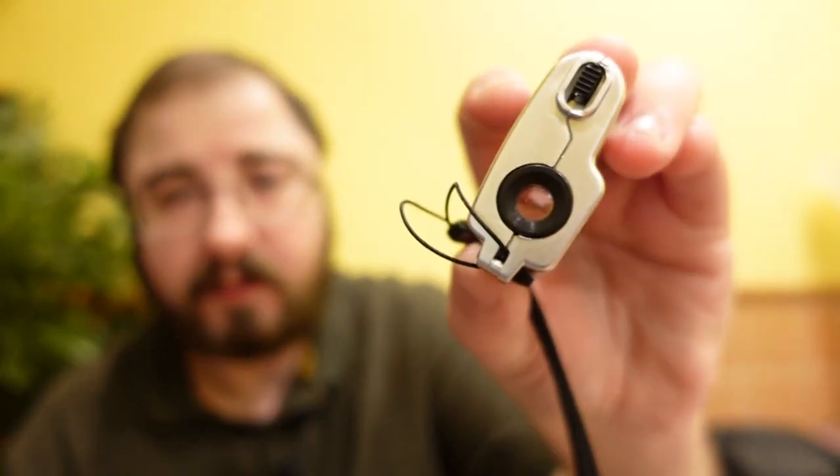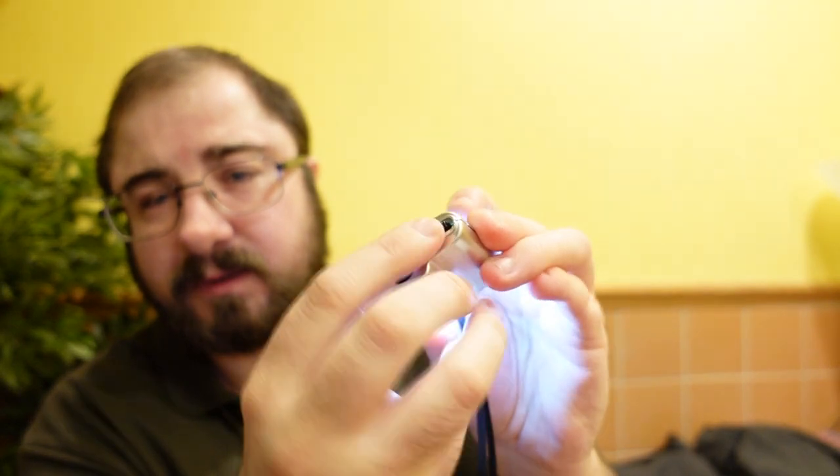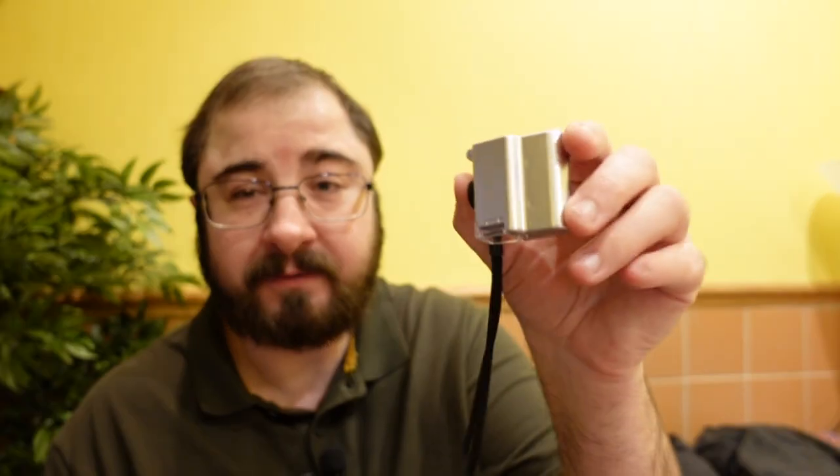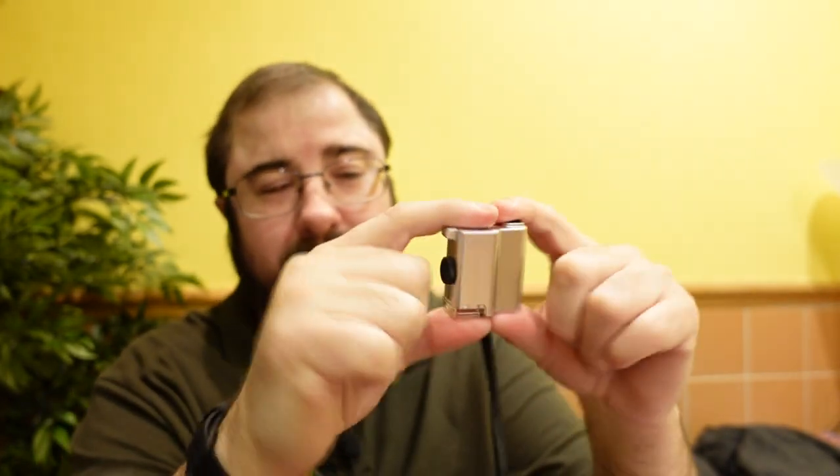That's your light switch, which you don't really need, and the batteries on these sorts of things last a long time. This will fit nicely in your pocket — it is so incredibly small that it takes up no space whatsoever. And the fact that it's got a nice case to prevent it from getting scratched, that's a nice touch.